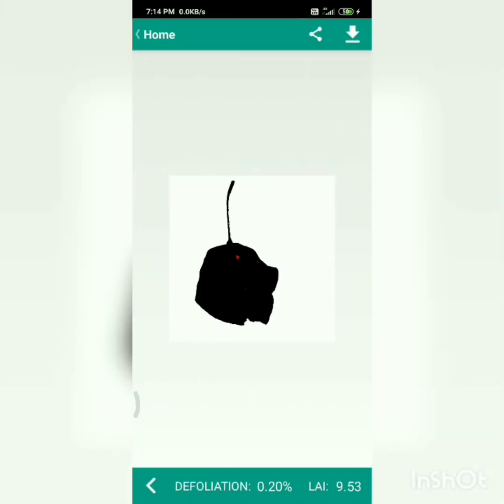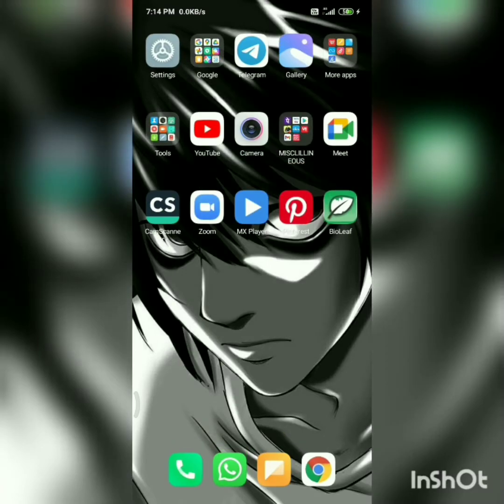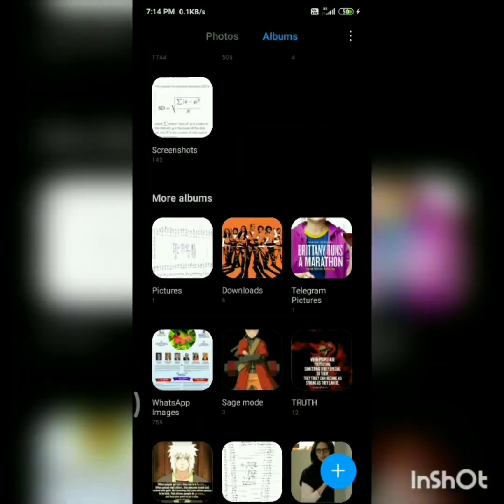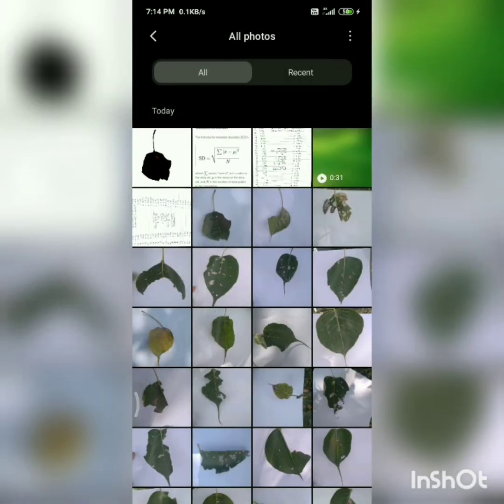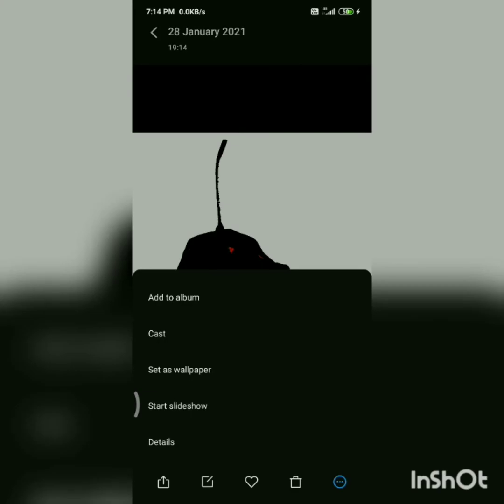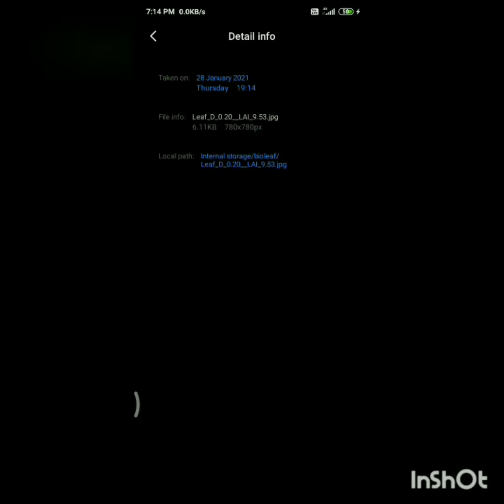I got the defoliation percentage and also leaf area index. I'm going to download that. Once you have downloaded, you have to check in your gallery and refresh it. Yes, I got this image. I'm going to click on the details. Here also you will get the leaf defoliation and leaf area index.